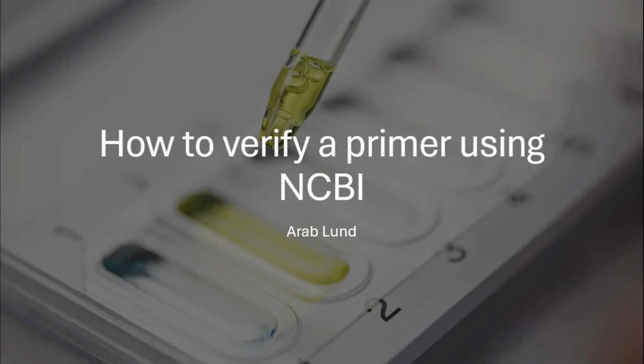Without verification, we place an order for the primer and use it. Ultimately, we sometimes do not get good results. So whether you get a primer from your friends or published articles, don't believe it 100%. You must verify a primer before placing an order.